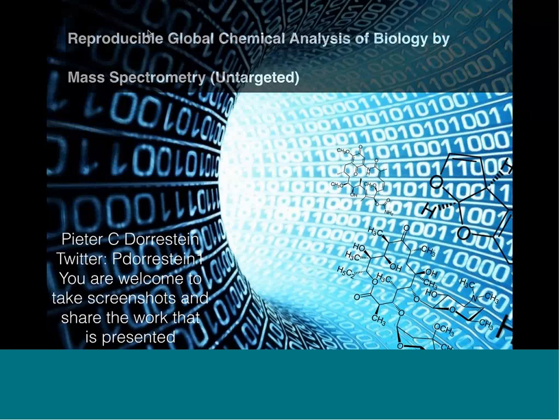The other aspect of it is the in silico methods for annotating spectra are becoming better and better. Now, they're not perfect yet, but certainly if you would have talked to me 3 years ago, I would not think in silico approaches were reasonable, because 3 to 5 years ago, the CASMI challenge showed that only about 5% of the annotations were actually correct. Now in 2016, that number has jumped to 50% of the annotations being correct. And so the tools are becoming better.